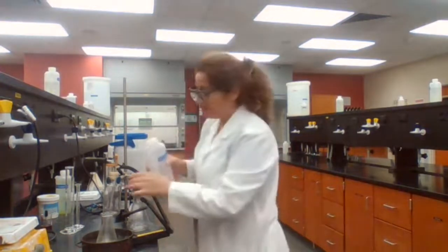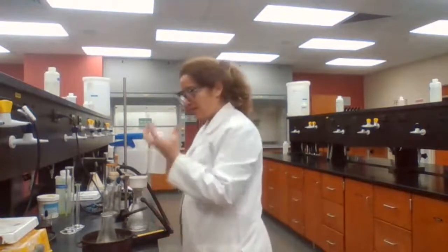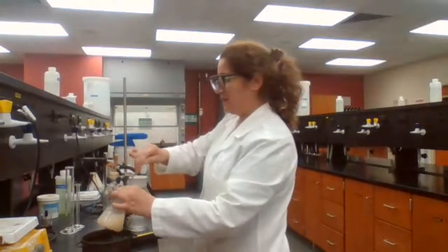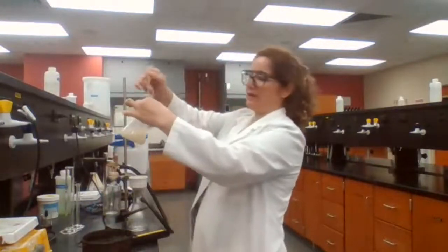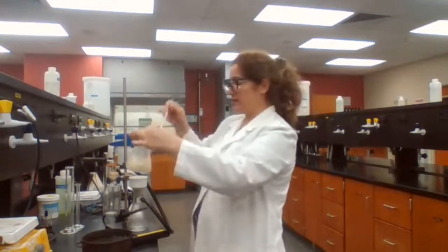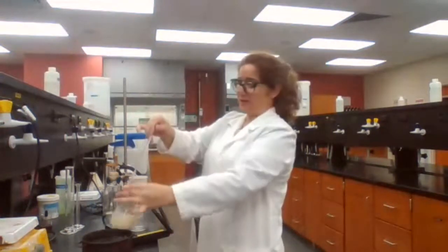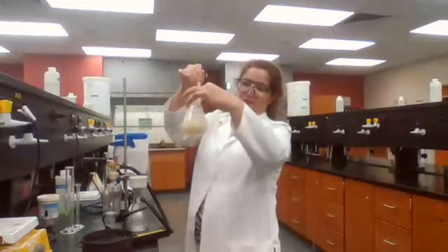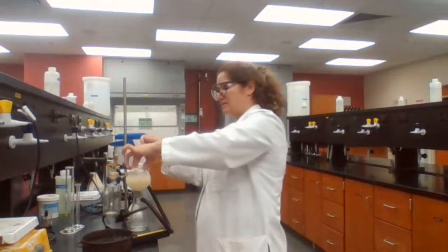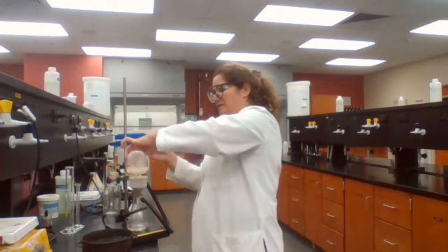Use some cold water to make the paper wet, because when the paper is wet, it will stay still and it doesn't allow the particles to go underneath. Because I want to transfer all the solid into the funnel, I have to mix it, because if not, only the liquid portion would go and most of the solid would stay. So I keep mixing and pouring into the Buchner funnel.